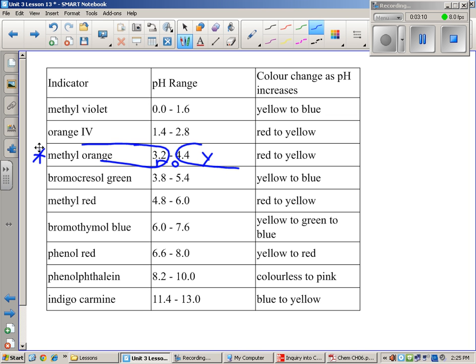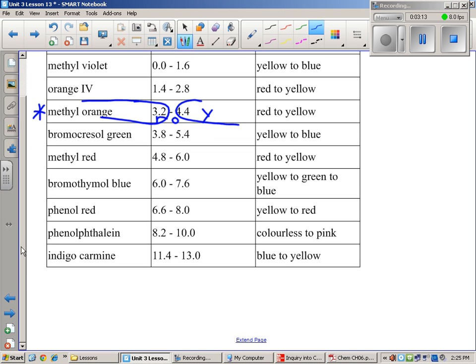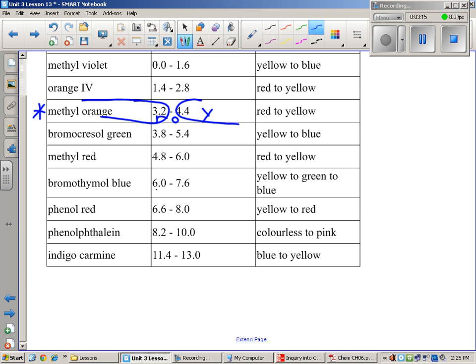And I'm going to give you some examples on what to expect with this. This one here, they actually tell you, in case you don't know. This is yellow here, so anything at 6.0 and below is yellow. Anything at 7.6 and above happens to be blue. And the mixture of yellow and blue would be a greenish color. So anywhere from 6.0 to 7.6, you'd probably see a green. You might say, would I see different shades of green? The answer is, yeah, probably, okay? What exact number does that correlate to? Don't know, okay? All I could tell you is that it's between those two, all right?